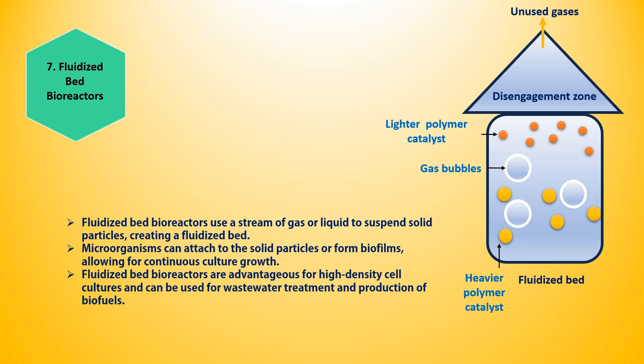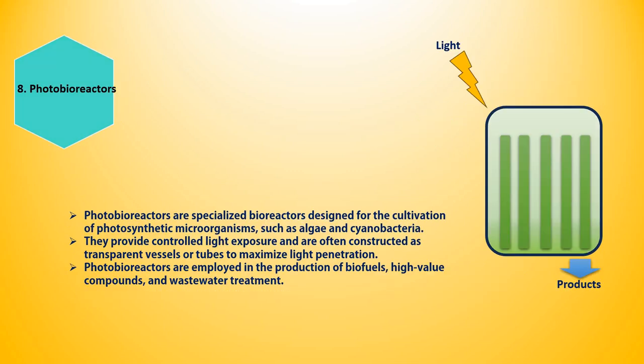And in the case of wastewater treatment, sewage culture systems and the production of biofuels, the cell volumes are very high, and in those cases after the reaction, if we try to segregate the materials from this high volume material, it will be a very tiresome job. So for that reason, this fluidized bed is used, where it will be easier to segregate these polymers after the reaction.